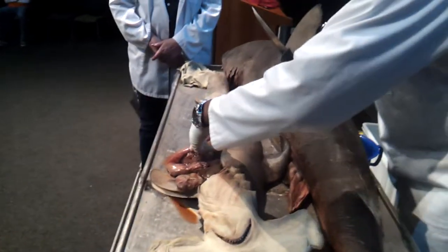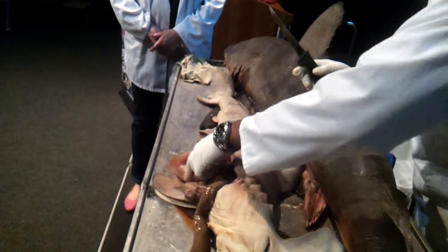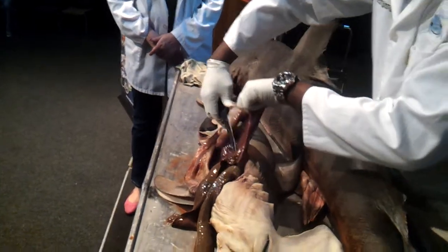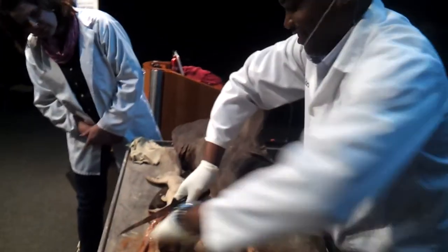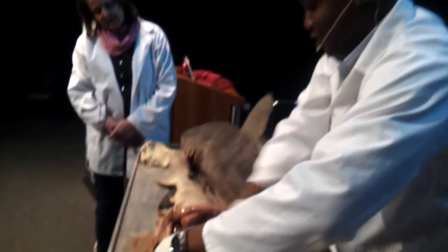The first organ we take out is a shark's tongue. No. Check it out — you tell me what this is.